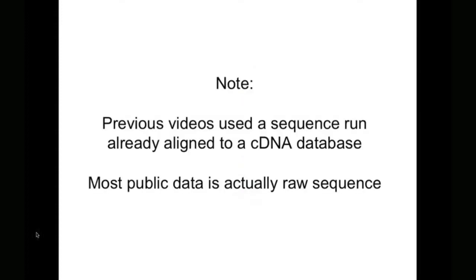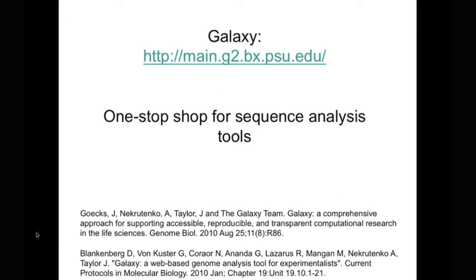Just a quick note, our previous videos on using the terminal used sequence runs that were already aligned to a cDNA database, and if you do your sequencing in-house, this is the form that your data would be in. However, if you're going to start from publicly available data, most of that is found as raw sequence. And so the first thing that we're going to do is learn how to align a raw sequence to an appropriate database.